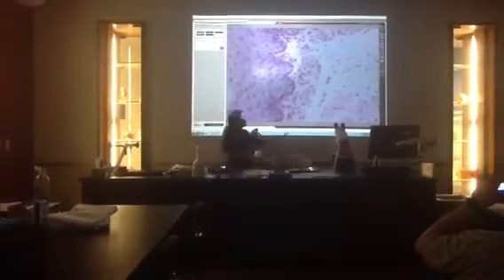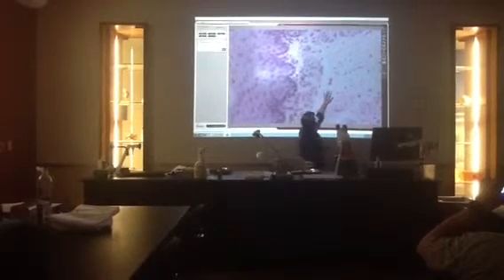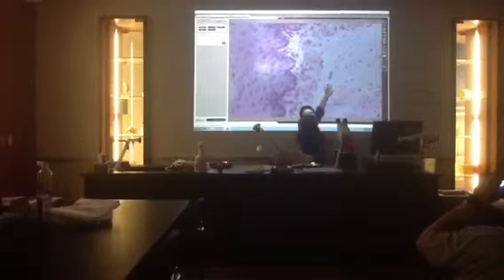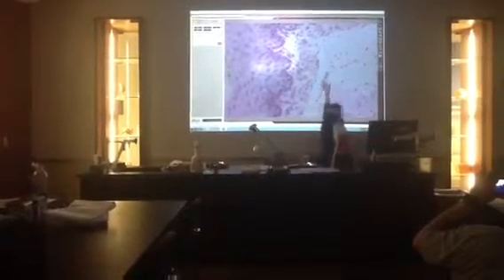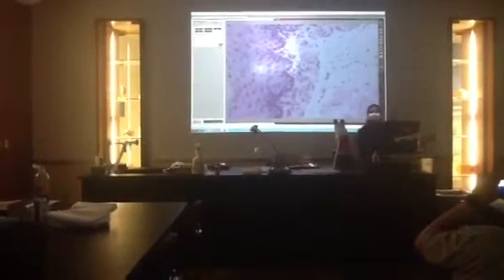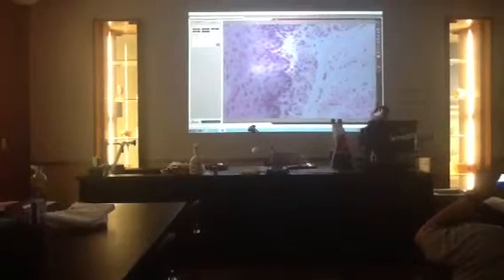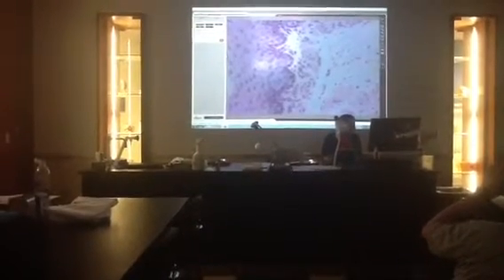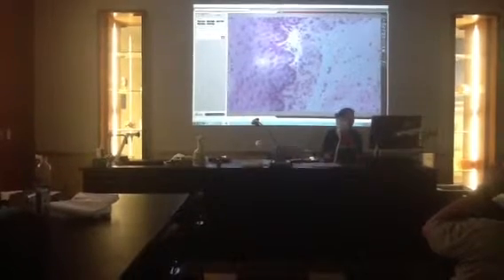And then what would all this be here? Muscularis circular? No, not the circular one, it's the submucosa. Oh, yeah, sorry. Submucosa. Yeah, I think my computer's getting it.